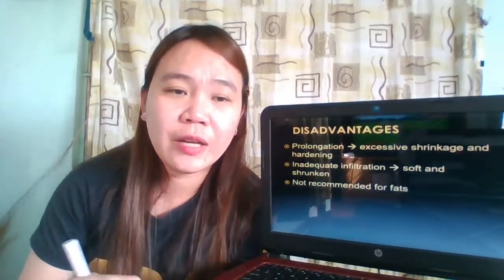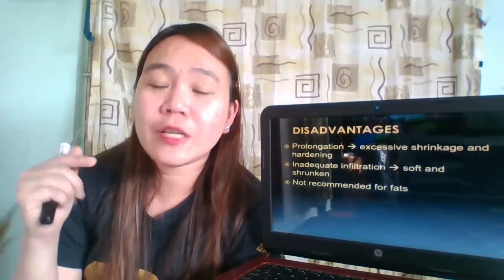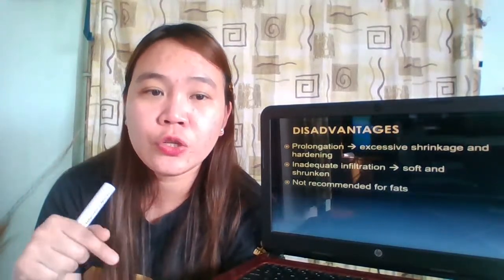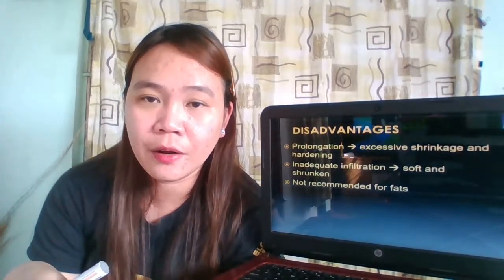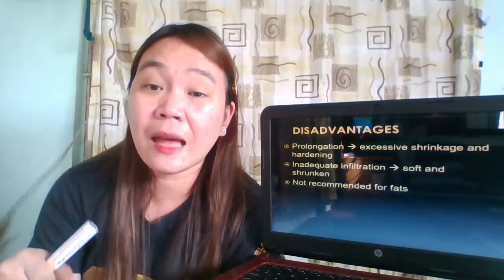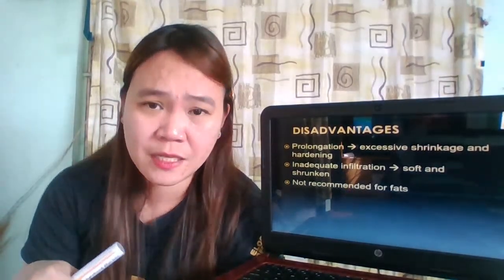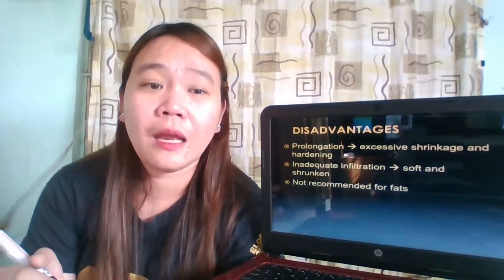Another observation is your sections will break up. Your sections will tend to break up during flotation. So I repeat, breaking up of sections during flotation is another clue, another manifestation, another evidence that there is inadequate infiltration.